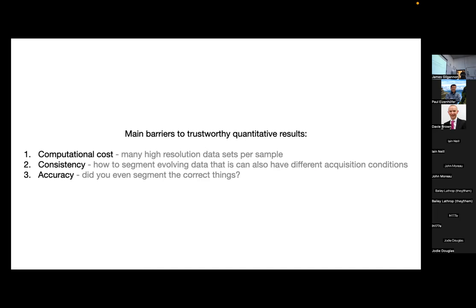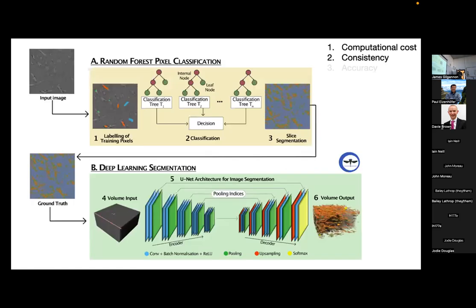And then the biggest one, and this is kind of the holy grail that most people avoid in geosciences, is how do you have any accuracy for segmenting things? And I'm included in that. We only recently have had a way to do this. You do your best, you try to be consistent, and that's all you could do before. But Ian Butler in Edinburgh had a brilliant idea for systems that are reacting to have an internal standard to check your accuracy. So I'll cover that.